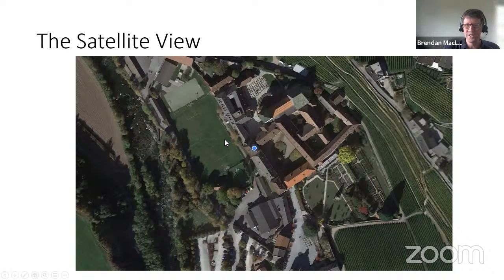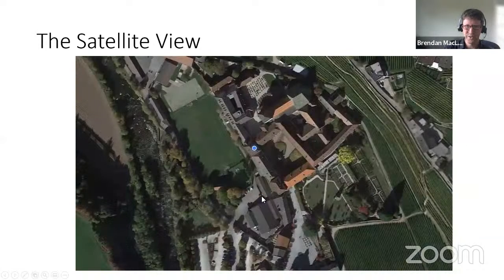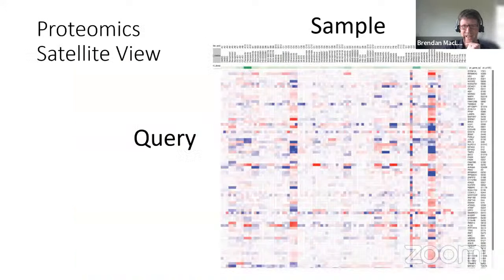And we're the ones who came up with the question, well, what's happening right here? We didn't go like, well, okay, to know what's happening right here, we have to go through this entire map. We were able to quickly zoom in and get a lot of information about the thing that we're interested in. And that's what Skyline's designed on.